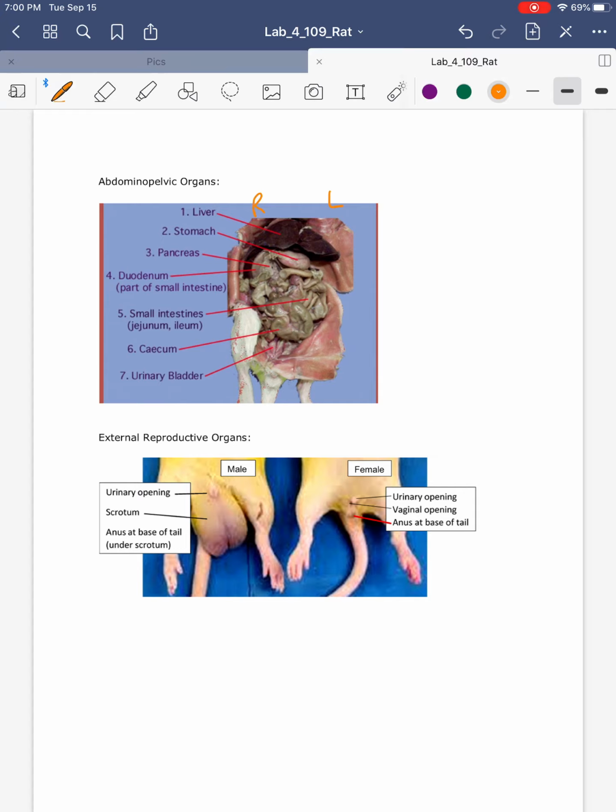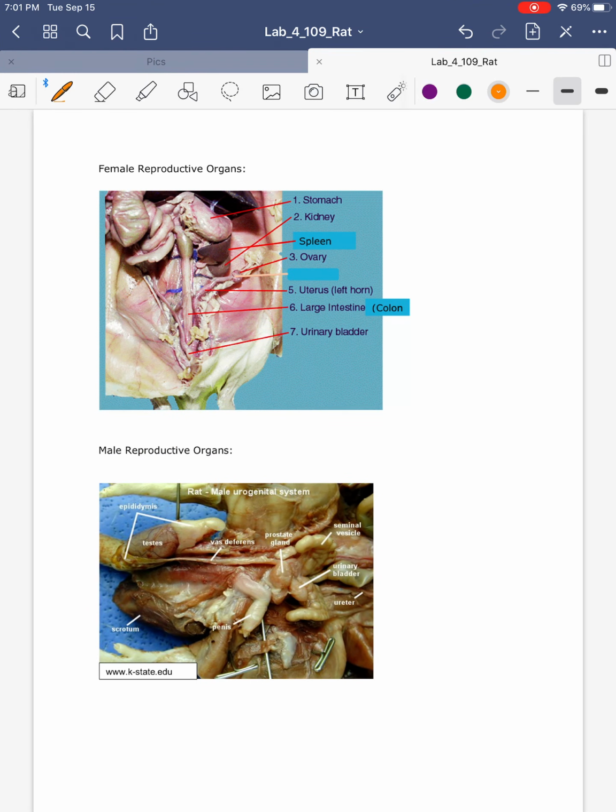Of course, the small and large intestine, let's go with purple. This would be the small, and then the large is a darker color here because it's wider in diameter. I know sometimes when you see this, you might automatically get intimidated, but if you can imagine our 4 quadrants, it can help you to think about these organs, okay? The bladder is going to be lower, and it's going to be a little ball-looking thing. There's the bladder. Now, when it comes to the reproductive organs, you don't need to know everything.